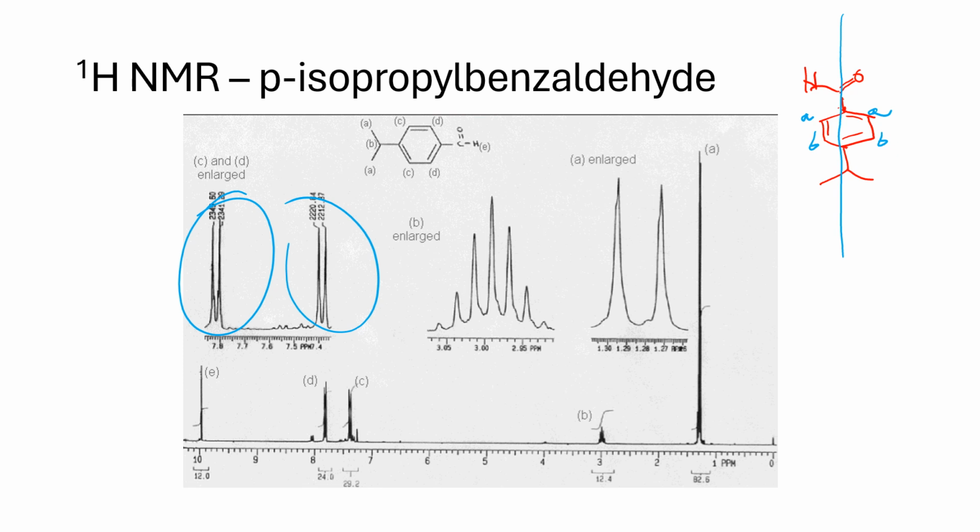That's it. The other pattern that we have here is what we discussed in the previous slide. That is the isopropyl pattern. So here, remember that in the isopropyl, you have an H here, and that pattern is the doublet and septet that we have here. But again, you want to remember that para disubstituted aromatic compounds give that pattern, two doublets.